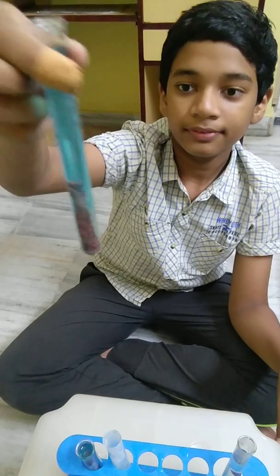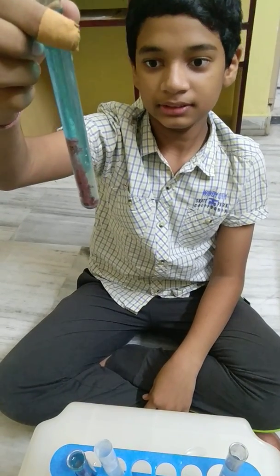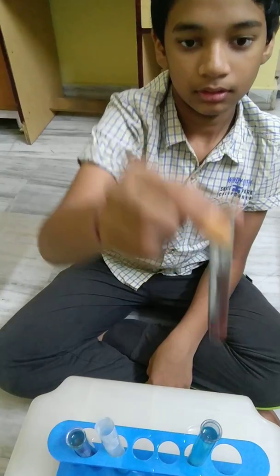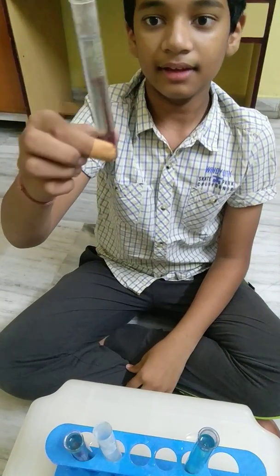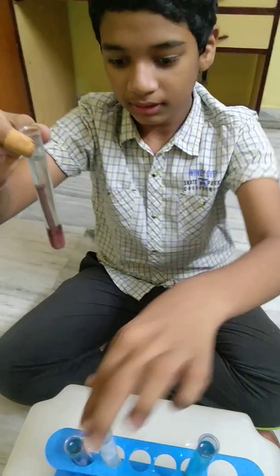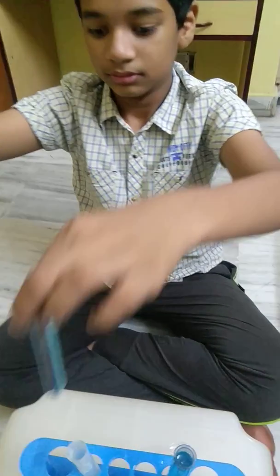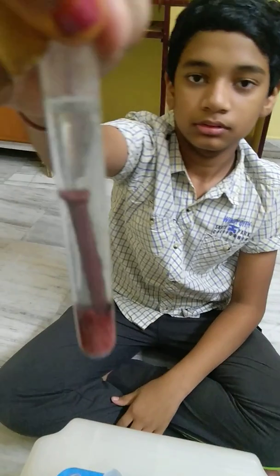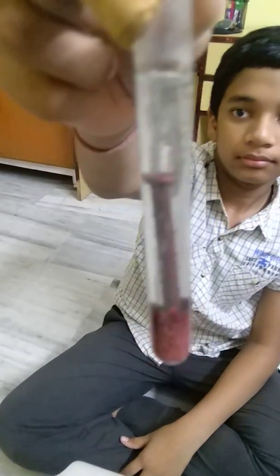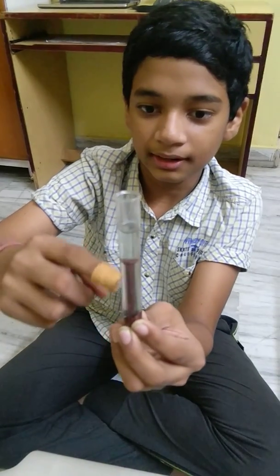I have let it rest for around 1 hour. And as you can see, the reaction is slowly taking place. A layer of copper has completely formed around the iron nail inside this one.